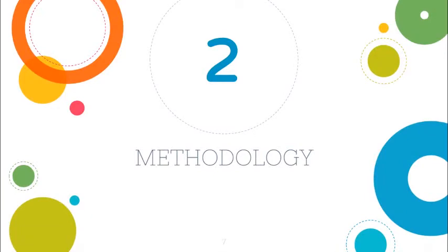For the methodology, in this experiment, five tests with different reagents were done to the following samples: acetylene, benzene, styrene, hexane, acetone, formaldehyde, ethanol, ethyl acetate, glucose, fructose, and sucrose. Before any tests were done, the colors of the samples and their reagents were noted.